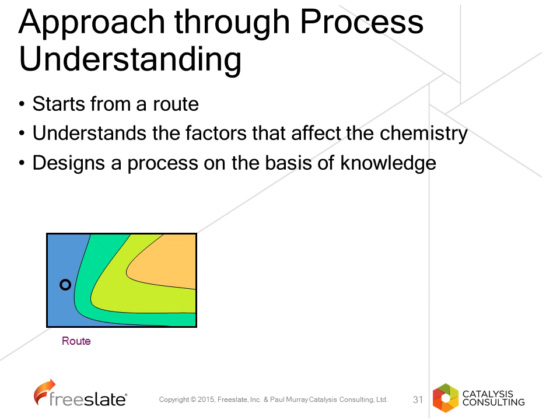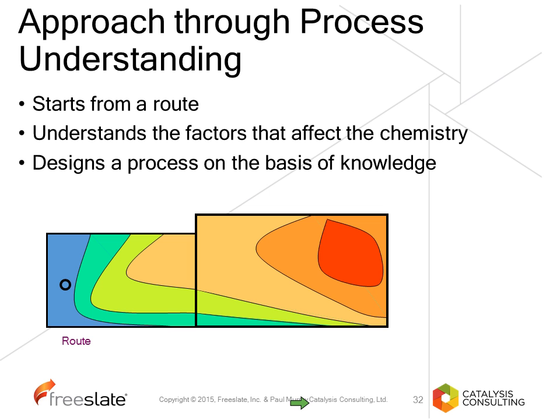And from this, from the first experiment that we thought of, we're starting to get some conditions which are going to give us a much improved reaction. And based on that, we carry out subsequent experiments. And those subsequent experiments bring us to where this reaction works very well. And we are gaining more understanding around the process. And from that, we can actually choose where you want to carry out the experiment. And from a process development point of view, you understand exactly where to carry out that experiment and over what ranges will give you a robust process.